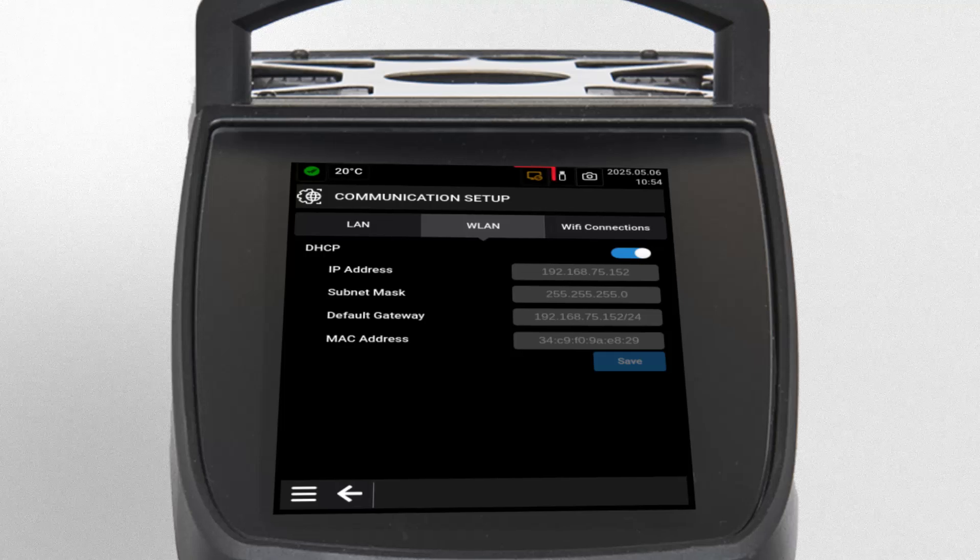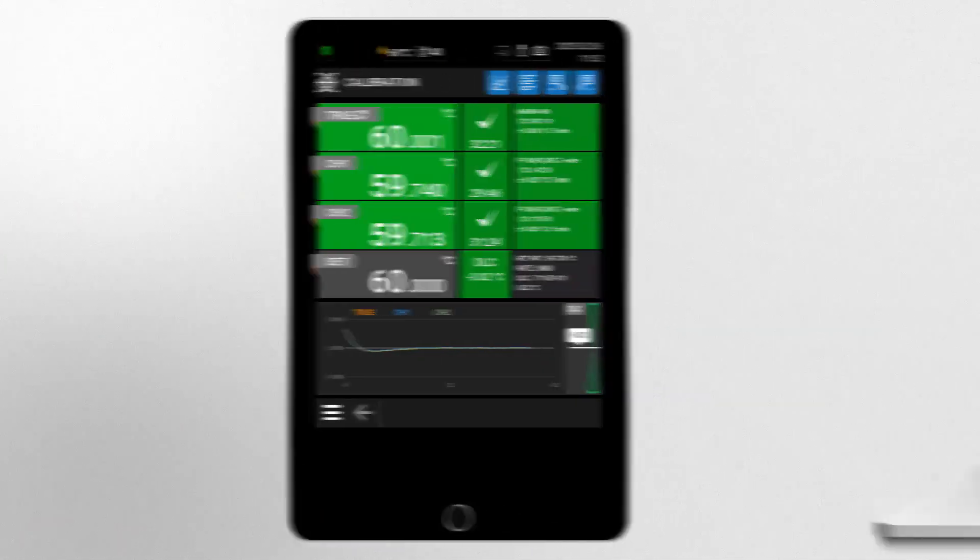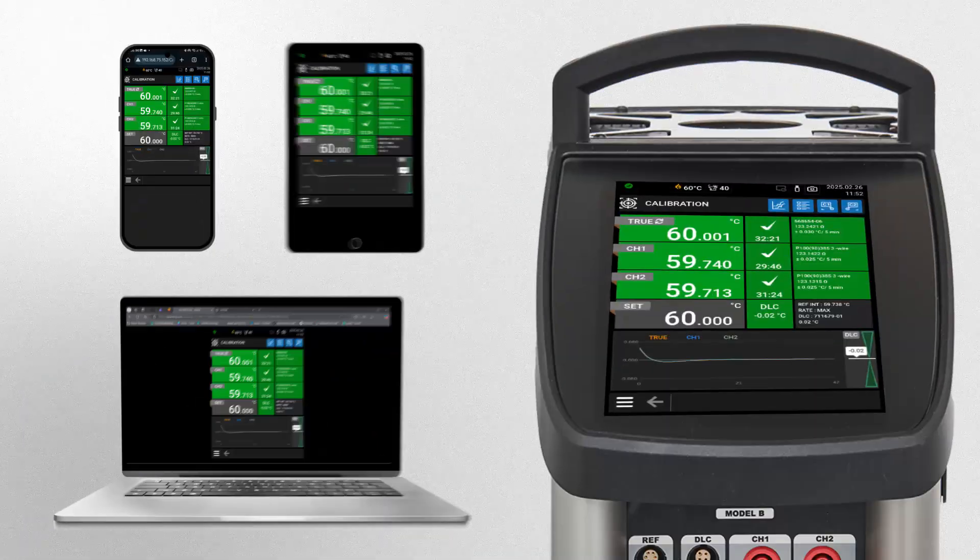Once connected, the RTCT remote icon turns orange, indicating successful connection. Adjust your browser window for the best view and start remote controlling the RTCT. You are now ready to enjoy full remote access to your Jafra RTCT Temperature Calibrator.